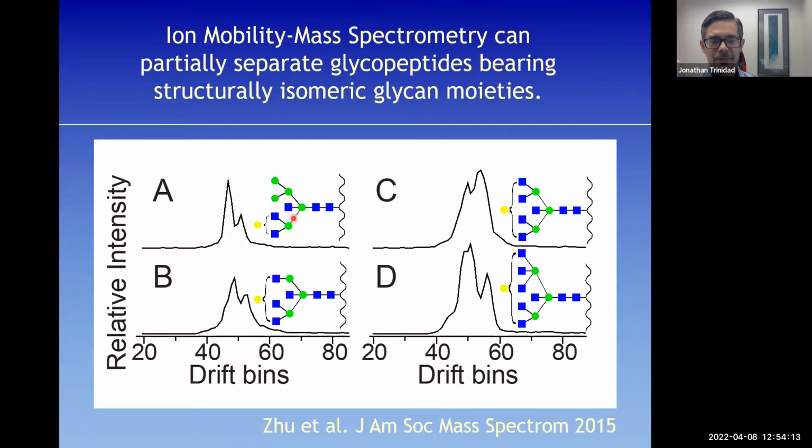And so we see for this particular glycosylated peptide, for example, there are 2 peaks consistent with some of it being here and some of it being here. At this stage, we don't yet know which peak is which, but we have evidence that there are 2 forms of this sugar. Similarly here, there should be 3 forms, and maybe we could see 2 clear peaks.